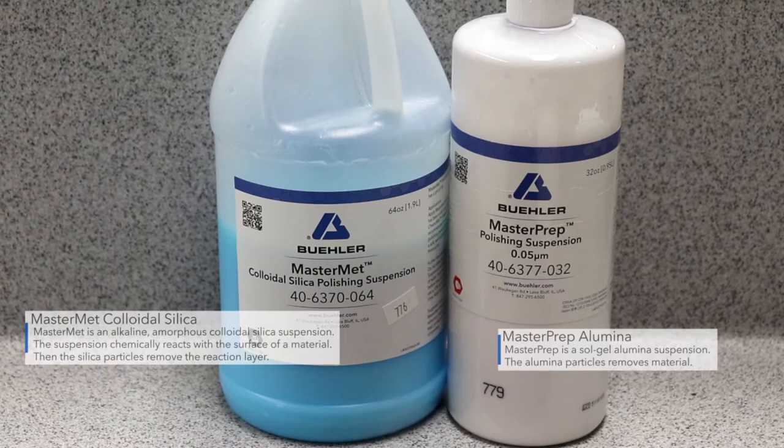The type of material being polished will determine which final polishing suspension is best. Mastermet is an alkaline amorphous colloidal silica suspension. The suspension chemically reacts to the surface of the sample and then silica particles remove the reaction layer. MasterPrep is a sol-gel alumina suspension. The alumina particles mechanically remove material.